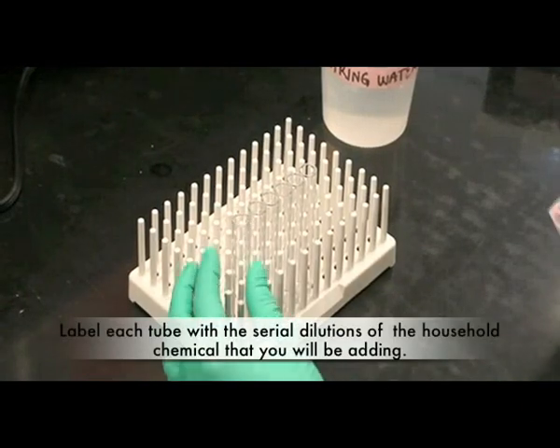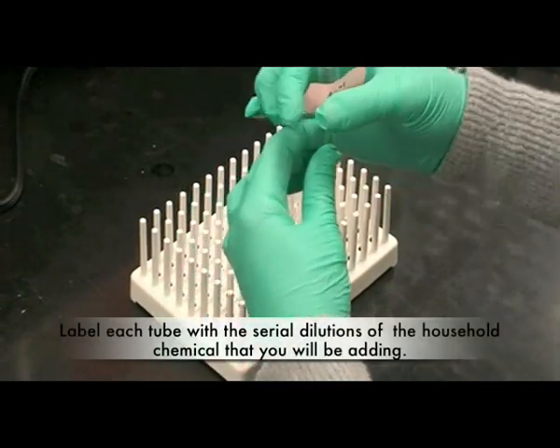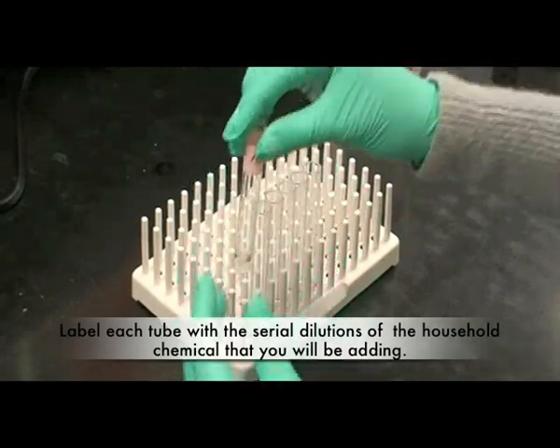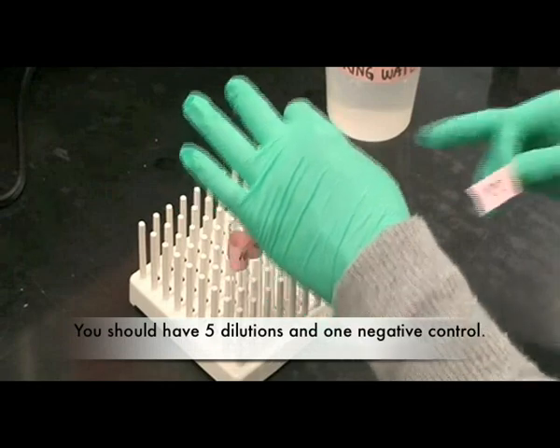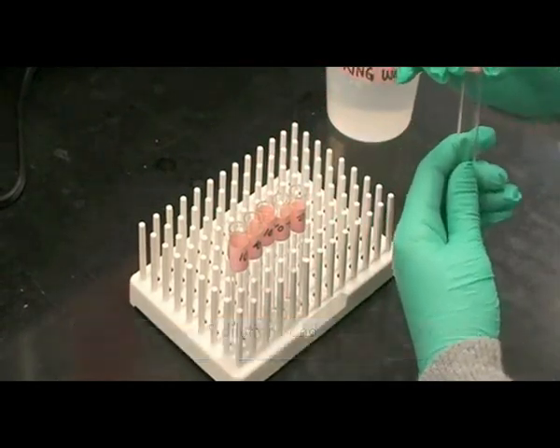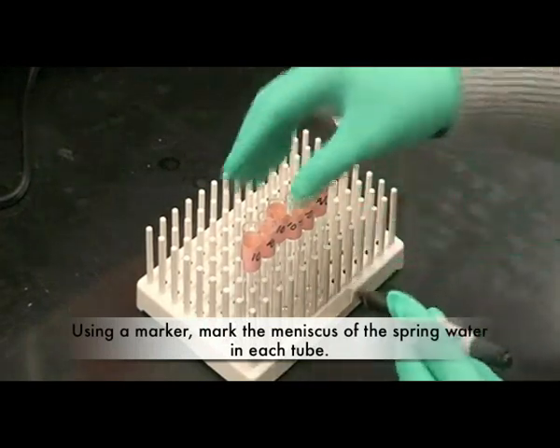Label each tube with a serial dilution of the household chemical that you will be adding. You should have five dilutions and one negative control. Using a marker, mark the meniscus of the spring water in each tube.